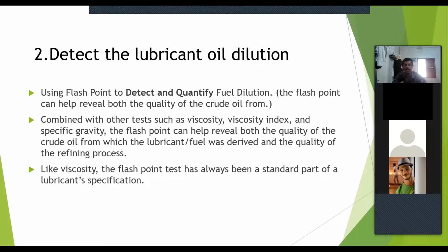Altogether we can say it as the quality of the oil, right? If we have used it for some time in the engine, it is already used. That means we don't know the exact quality. The quality will reduce, however, but we don't know exactly whether it can be used further or not, right? So by using this test, we can identify the dilution. That is application number 2.